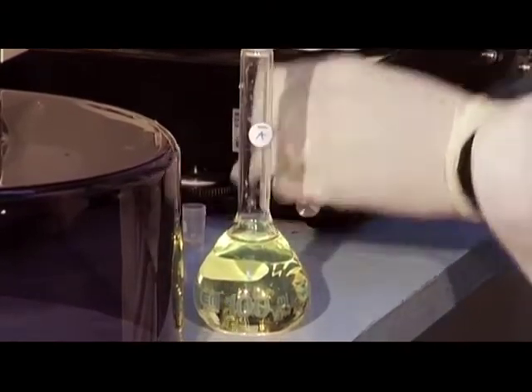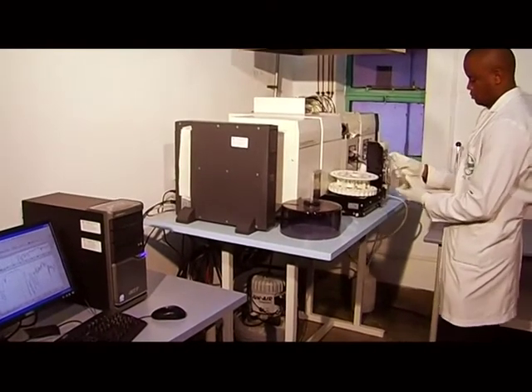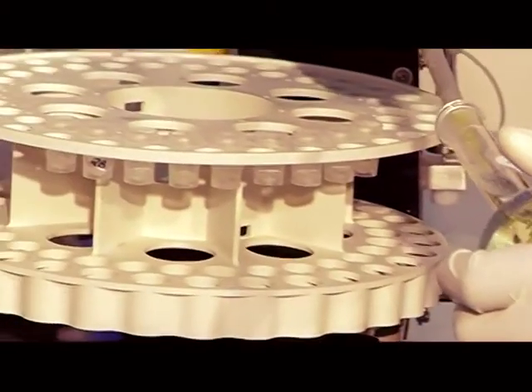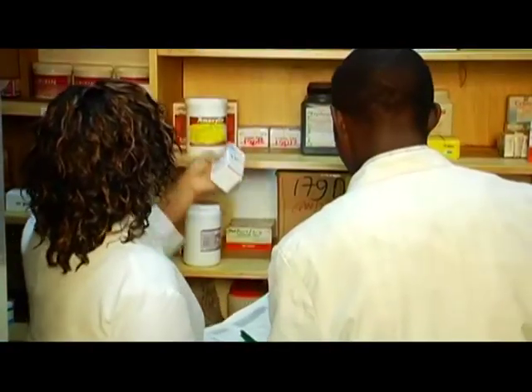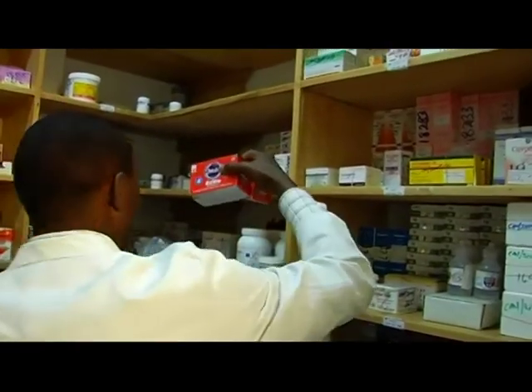The National Quality Control Laboratory has also diversified its activity and can now test, apart from pharmaceutical products, any liquid product for minerals, such as water, mineral water, energy drinks, and any other suspensions that are suspected to contain minerals. These departments ensure that the National Quality Control Laboratory achieves our vision of being an internationally respected center of excellence for the quality control of medicines and medical devices.